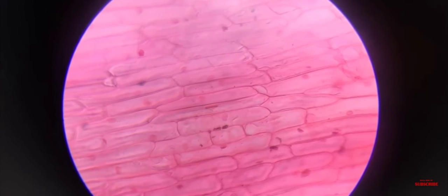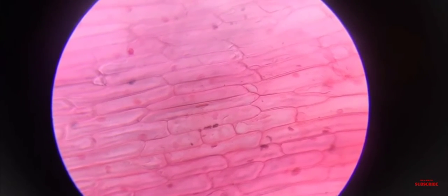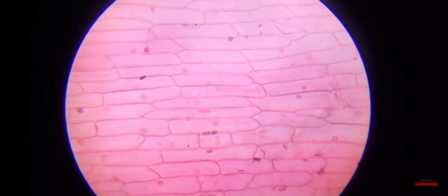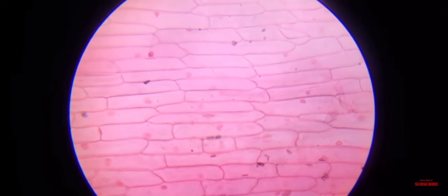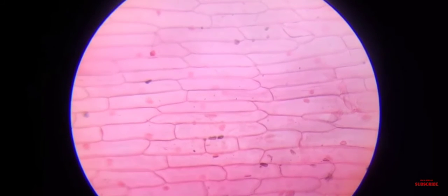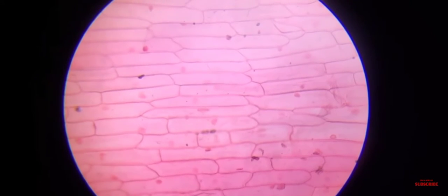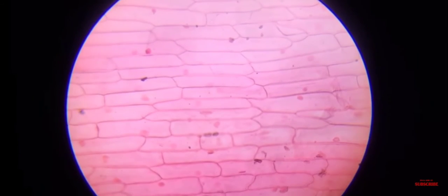The slide will appear in this way for the fourth activity. Because we have used the safranin stain, it appears light pink in color, and those slight dots are nothing but the nucleus, and the outer line of every cell can be clearly seen. The cells are arranged here compactly without any air spaces. So with the help of safranin, it is in this way. How are the cells arranged? They are arranged very compactly without any air spaces.